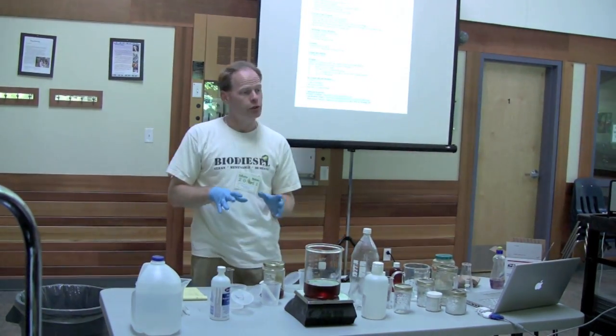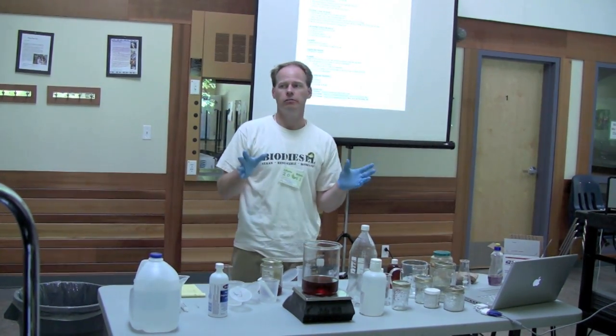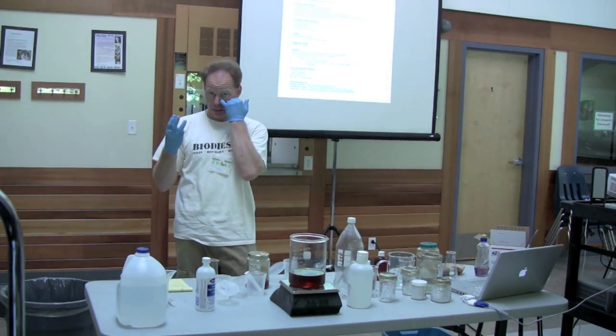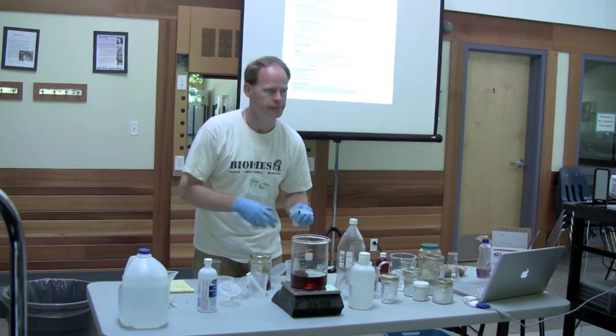If we had time, we would do this 3 times. And in traditional titration, you always like to do it 3 times and do an average. I'm going to do one more because I'm going to do it with turmeric and see how close the turmeric is.